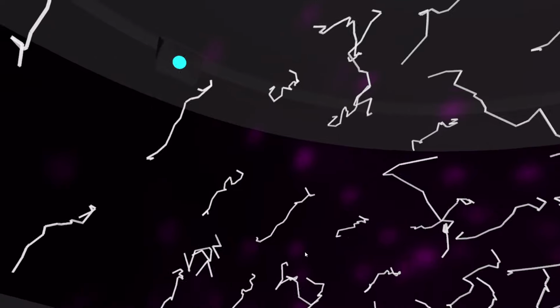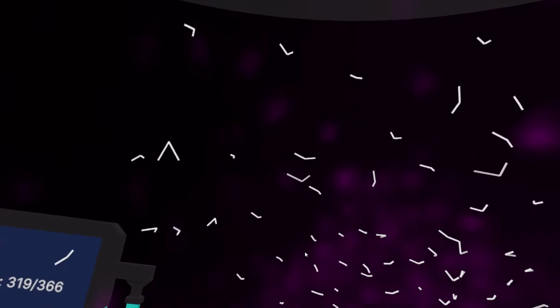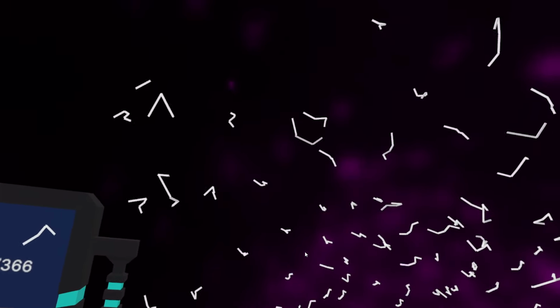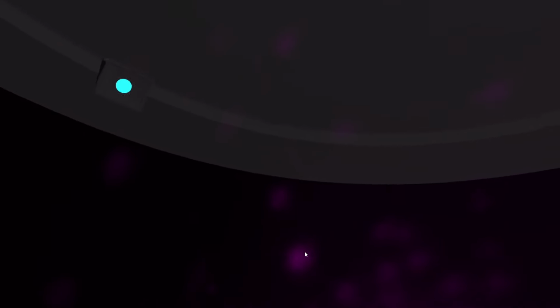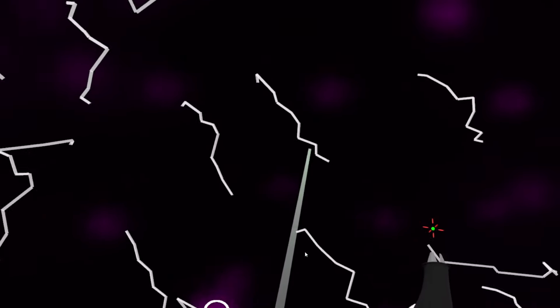No. Well, let's just pretend we have a cell division somewhere.